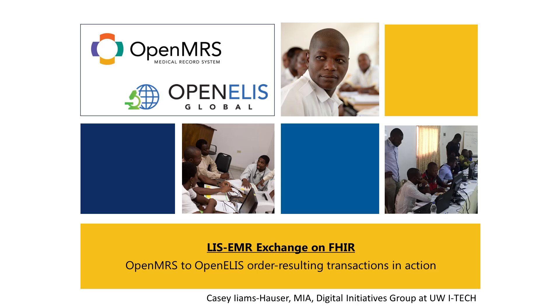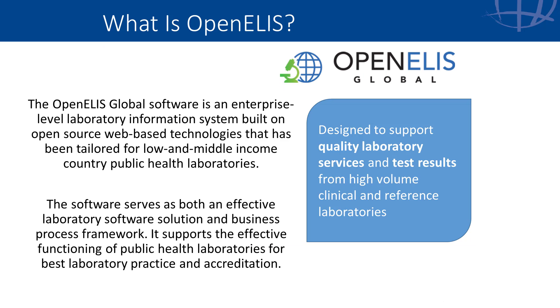I'm here to demo the lab orders and results workflow between OpenELIS and OpenMRS. OpenELIS is an open-source, point-of-service system designed specifically to support labs in the lab workflow.